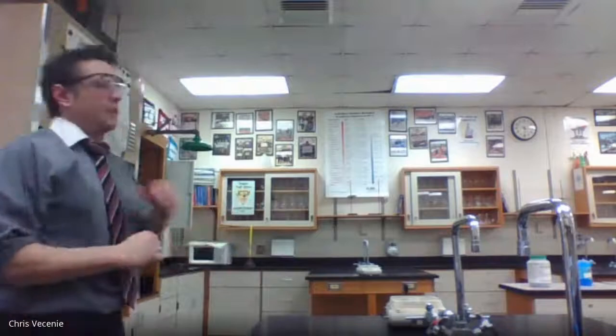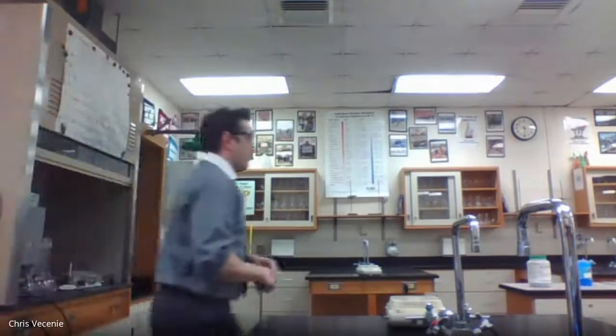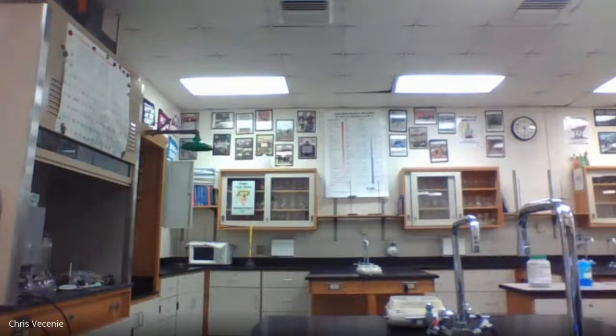So I'm going to the middle counter to get some things. First thing I'm going to do is go turn the gas on, because one of our experiments makes us use our Bunsen burner. I'll be back.